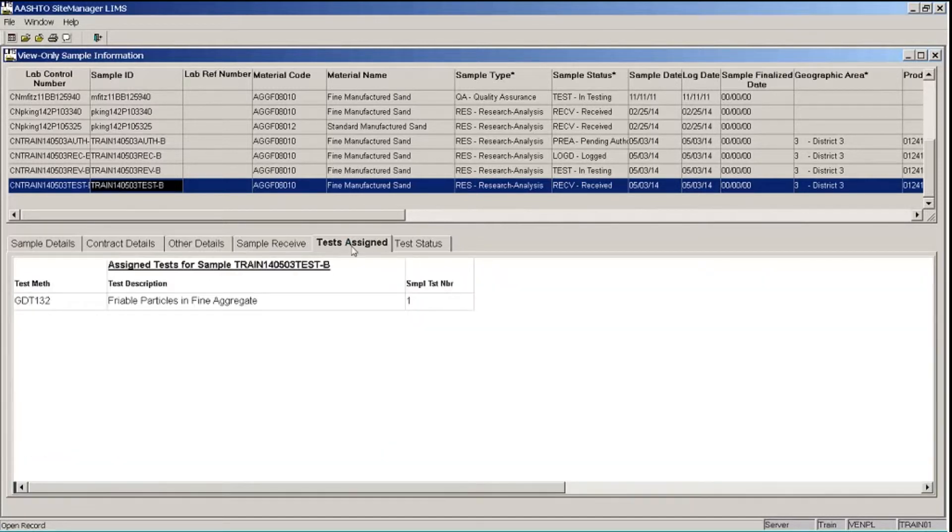The Tests Assigned tab will show all of the tests that were assigned to the sample. We only have one here.